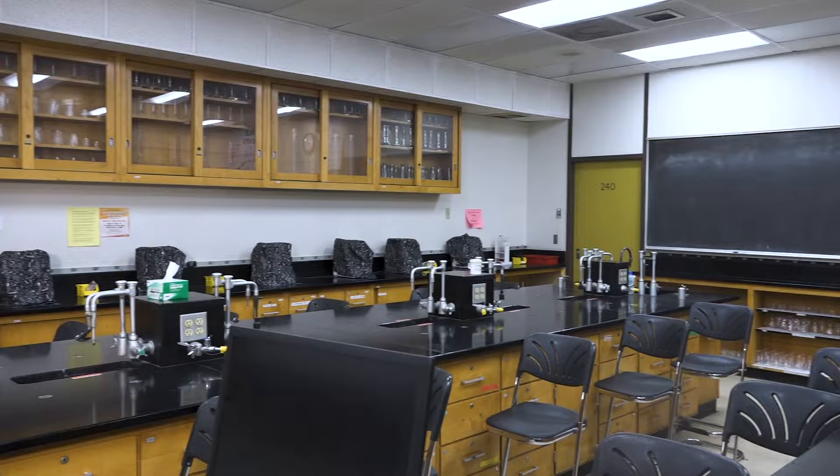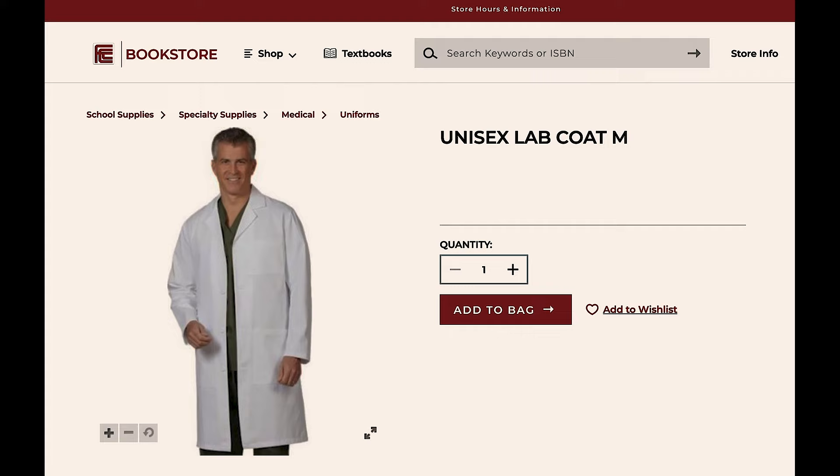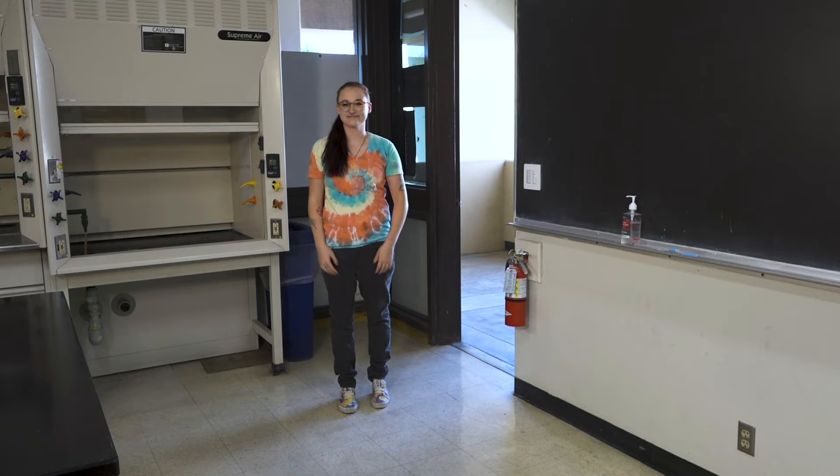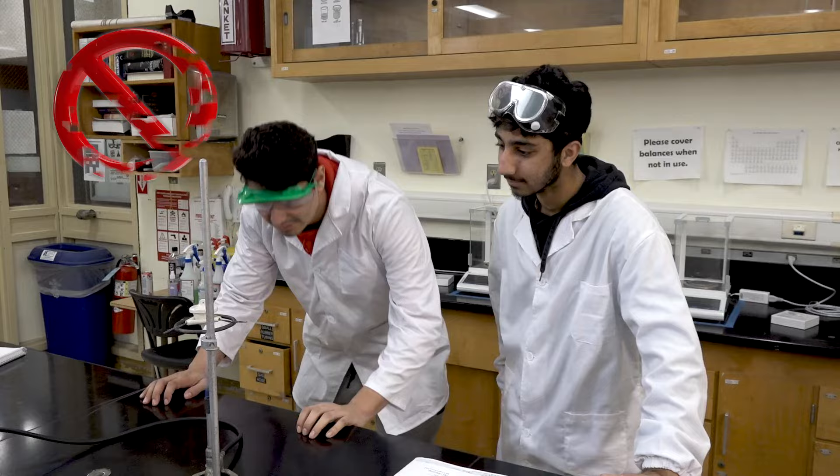Other essential pieces of laboratory attire that may need to be purchased at the beginning of the semester are a lab coat and goggles. Goggles help protect your eyes, which are especially vulnerable to damage from caustic chemicals. Make sure to wear them over your eyes during the entire lab period. They don't do you any good on top of your head.